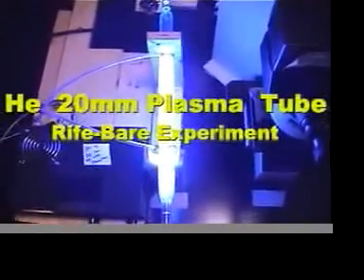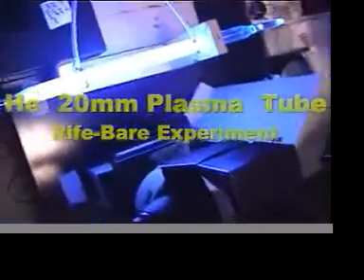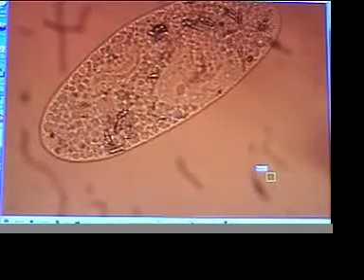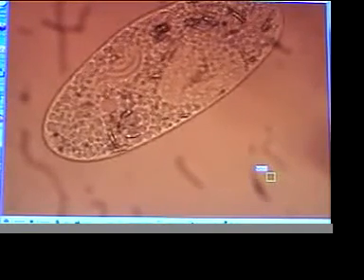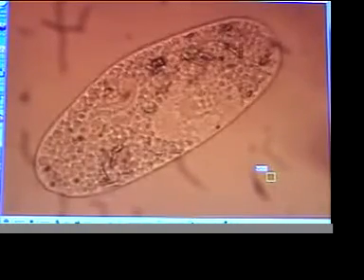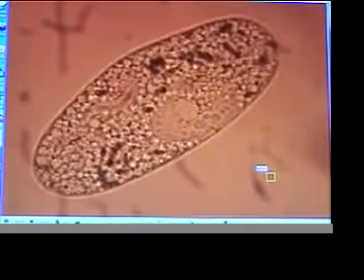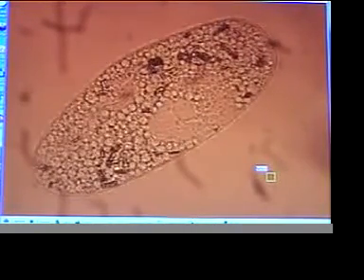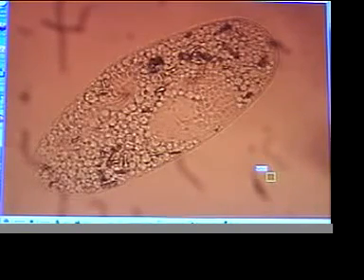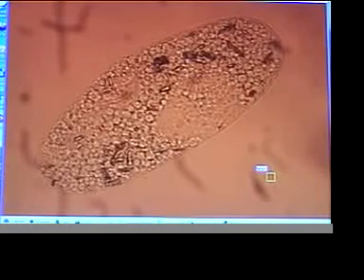It's mostly the center portion of the tube, as you can see. Not quite. Very sensitive. This is 40X. You can see he's filled with lots of little holes. These might be cavitation holes, and I believe he's actually internally destructing.